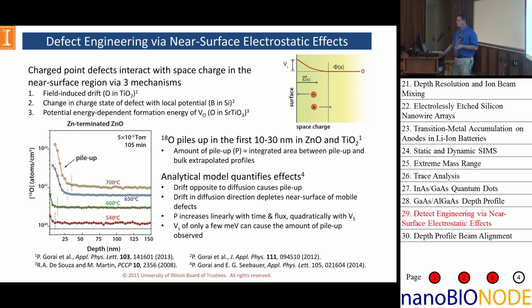If you do it nicely and correctly, this is some work on neodymium and uranium oxide, where they grew a film and annealed it, and so it has a nice Gaussian profile, and everything's wonderful. But one of the problems this researcher had was that he had very, very small samples, so he was trying to find shortcuts to the method, using a different sample to do the beam alignments.